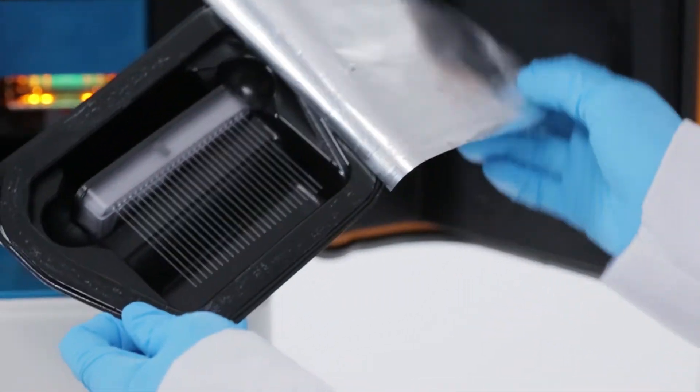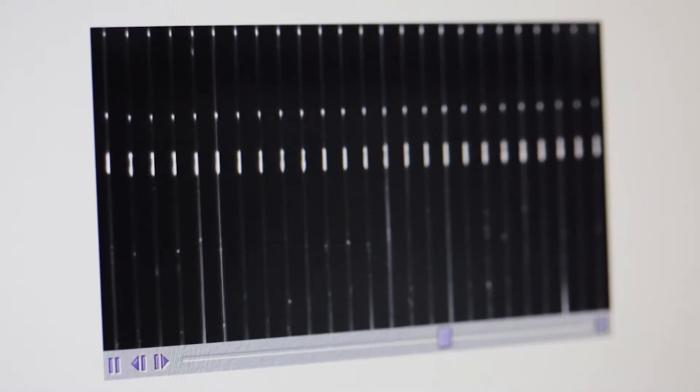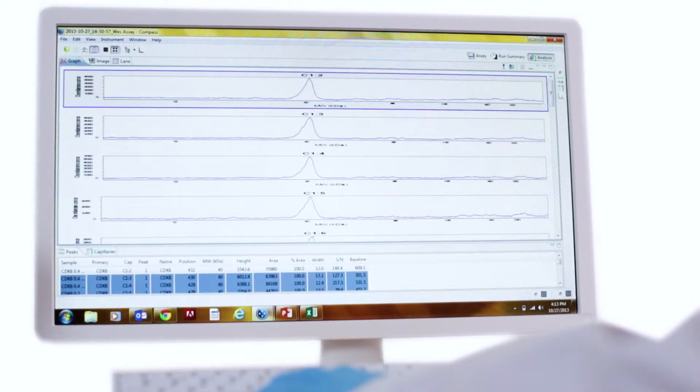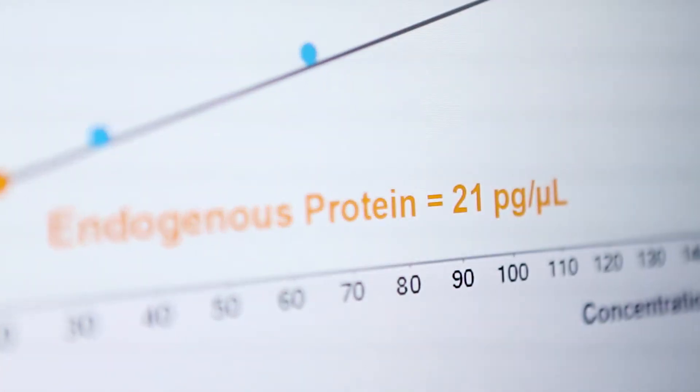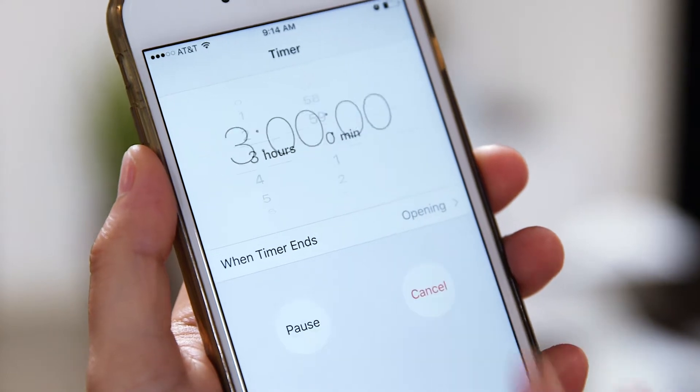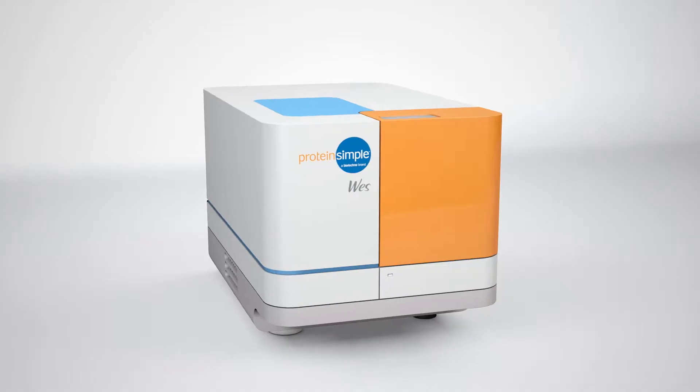Simple Western reinvents how Westerns are done, automating all steps from protein separation, immunoprobing, detection and analysis of data. It finally offers researchers an analytical tool that delivers quantifiable and reproducible results in hours versus days.